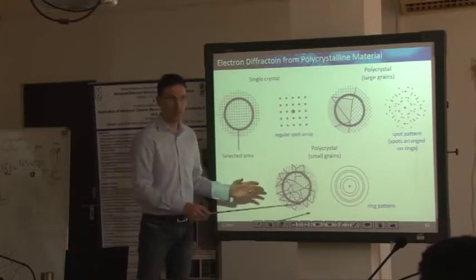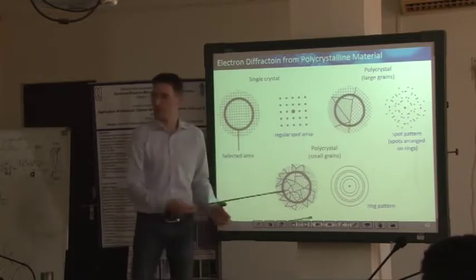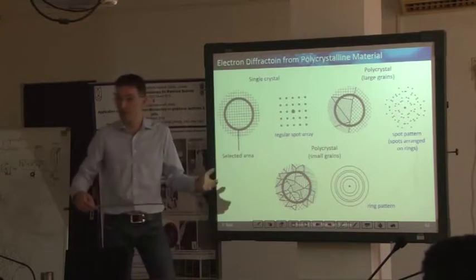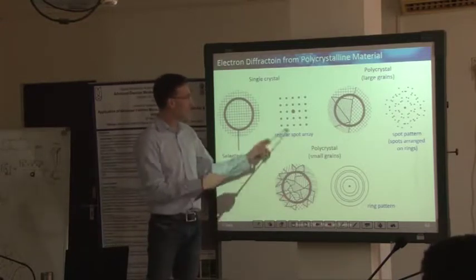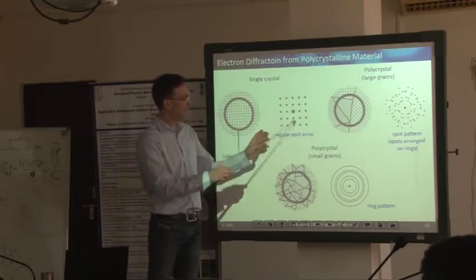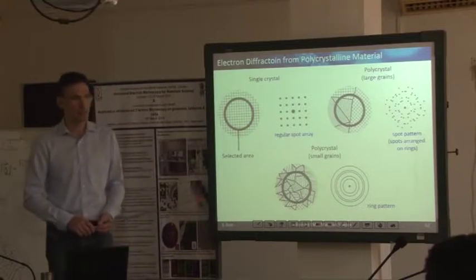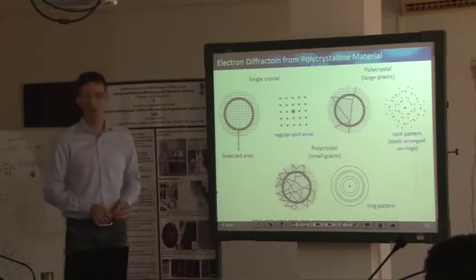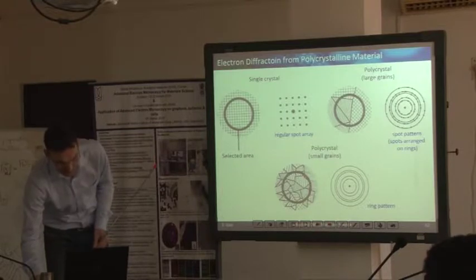And now it depends on whether or not you have the same crystal structure in there, or different crystal structures for a composite. If you have the same crystal structure, those reflections here are highly related to those rings. If you have many more crystal structures, you would observe the superposition of those contributions of the different phases.